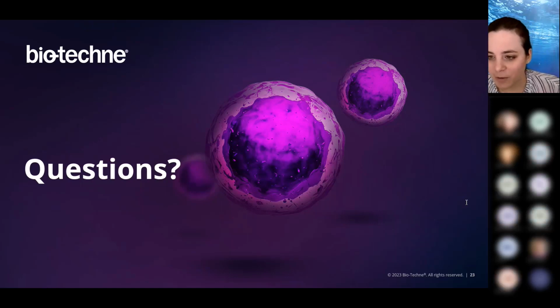Phil helped answer that question. Our R&D department tested a variety of targets and antibodies during the development and had little to no effect on the detection of the downstream antibody detection with protein normalization.